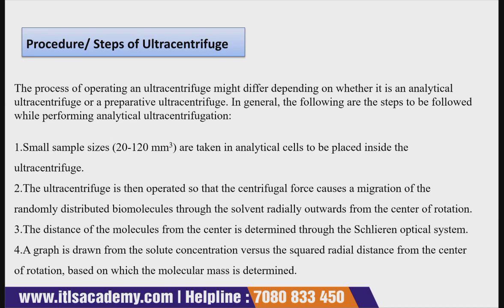Now let's talk about the procedure, or the steps, of ultracentrifuge. The process of operating an ultracentrifuge might differ depending on whether it is analytical or preparative.